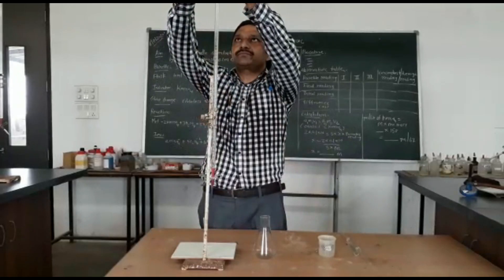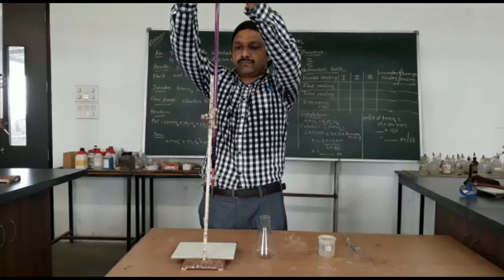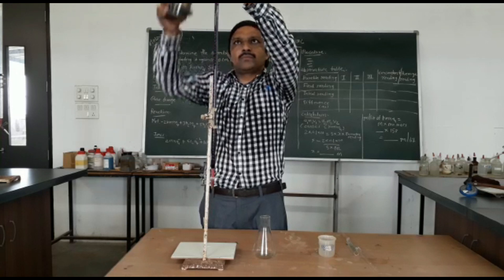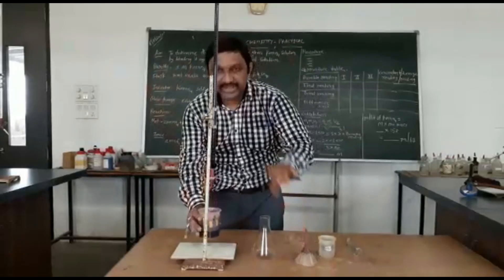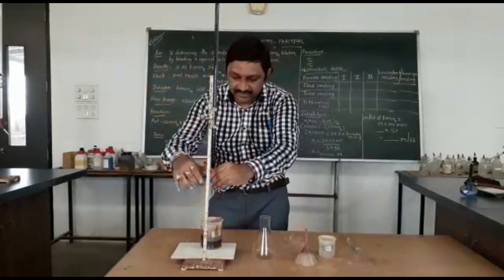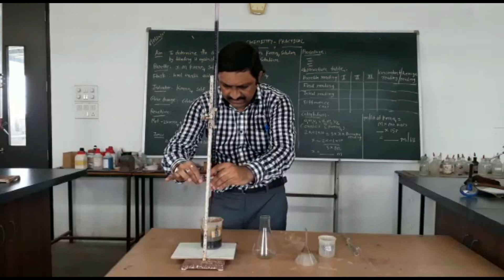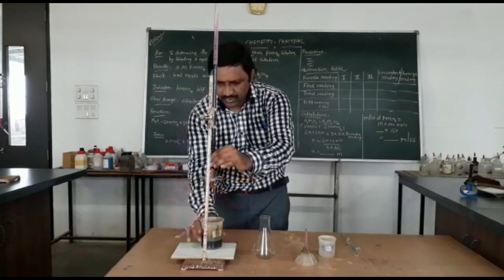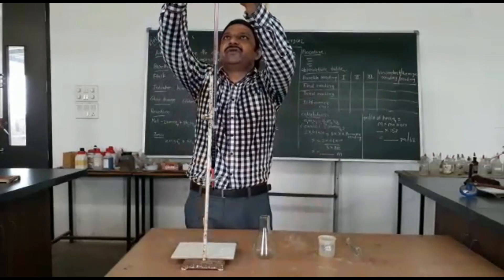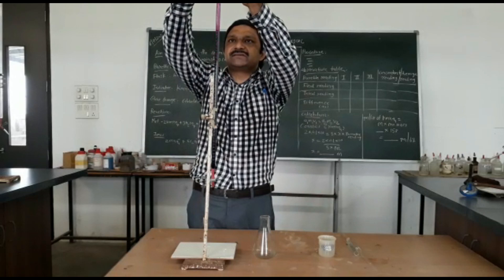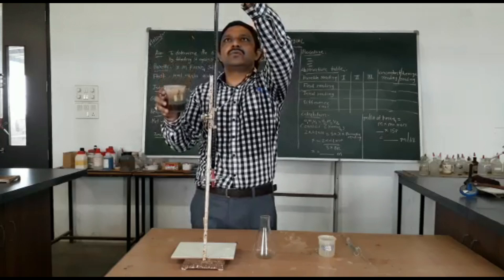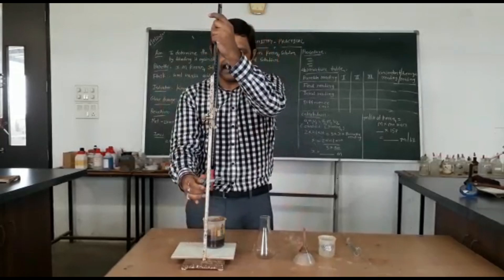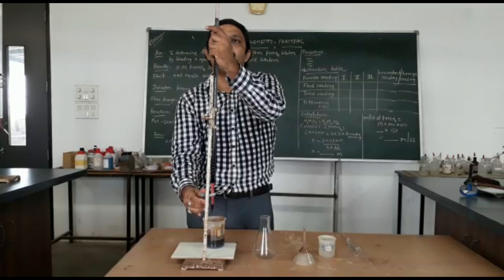Fill up the burette with KMnO4 solution and set the jet. Set your zero at the upper meniscus — your zero is set clearly.